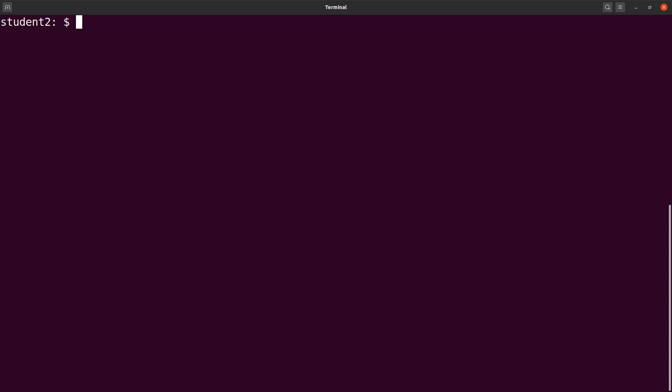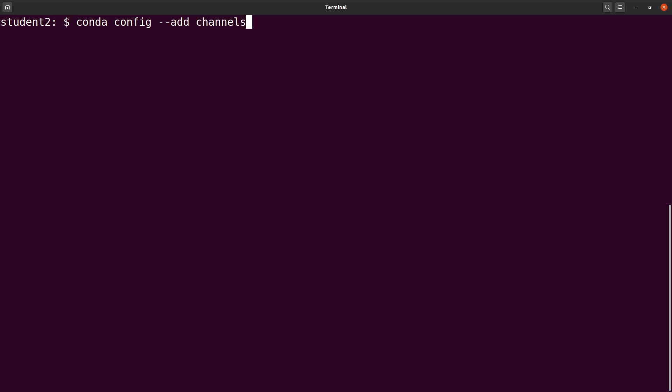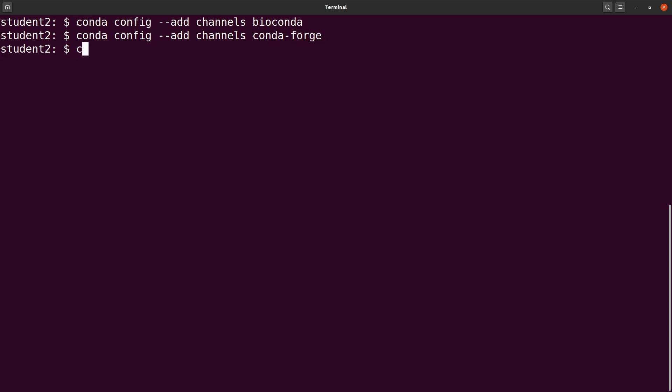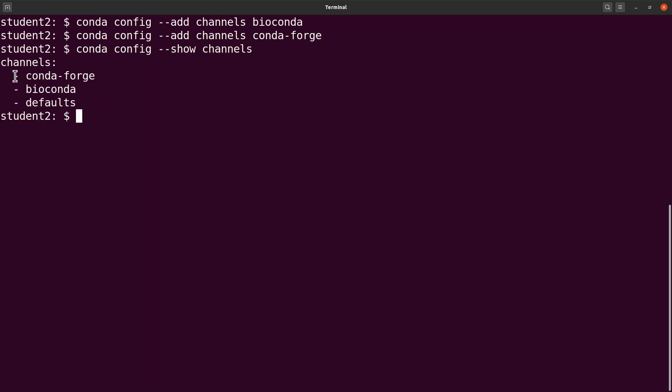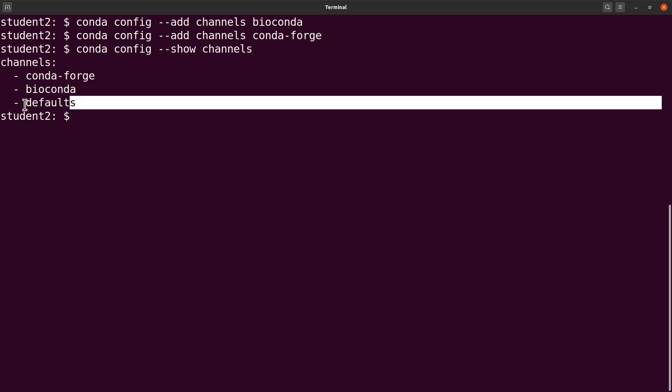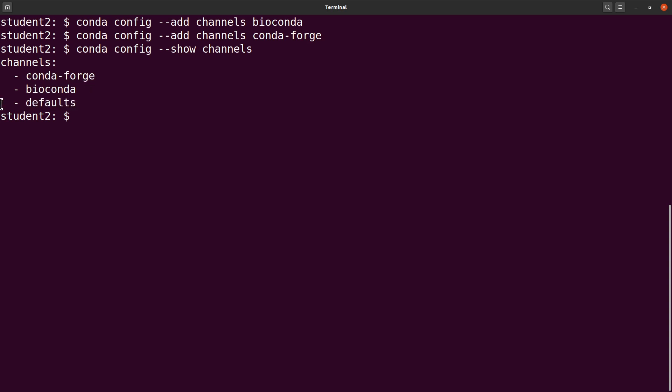The first thing to do after you have installed anaconda is to add channels. We will add two channels, bioconda and conda-forge. We say conda config --add channels bioconda. Let's add the second one. Let's confirm that the channels have been added. We say conda config --show channels. We have conda-forge, bioconda.